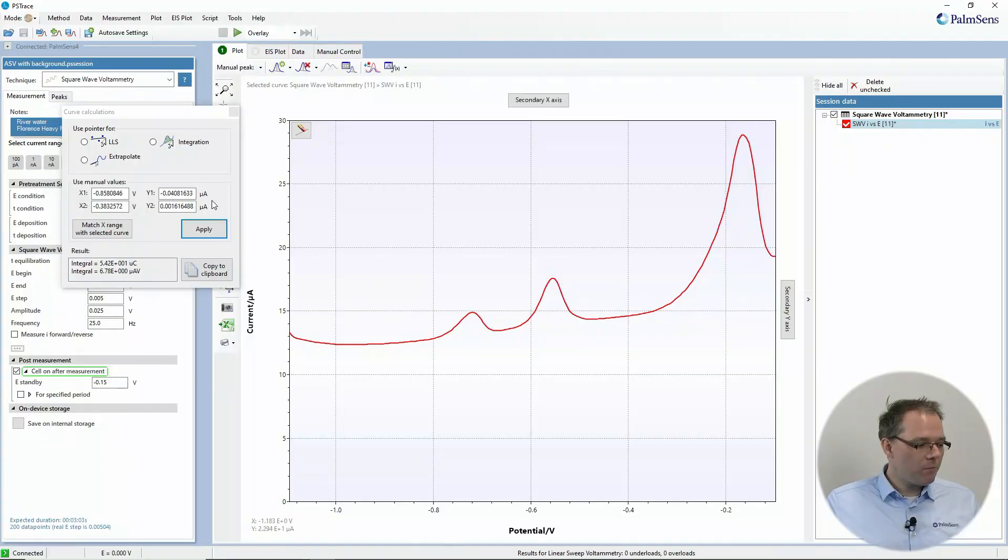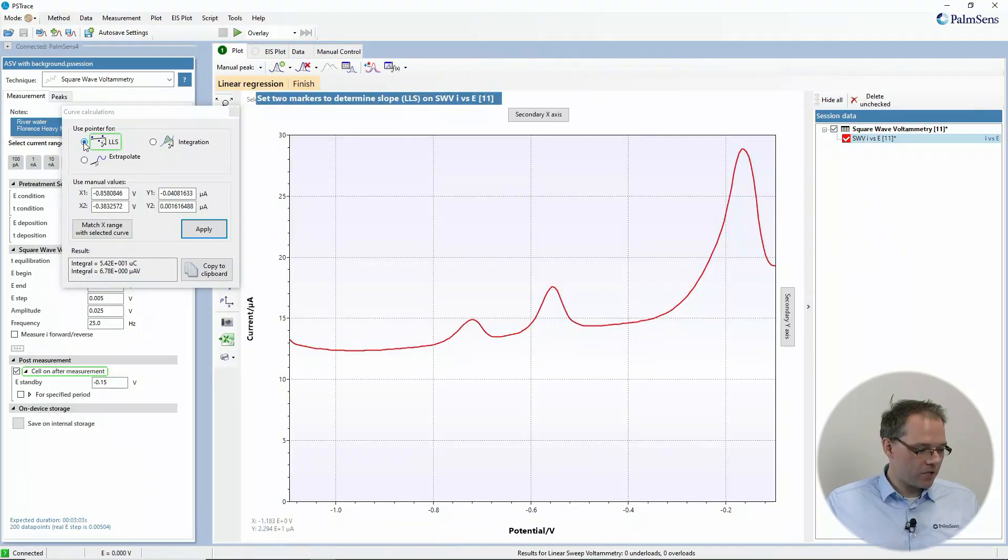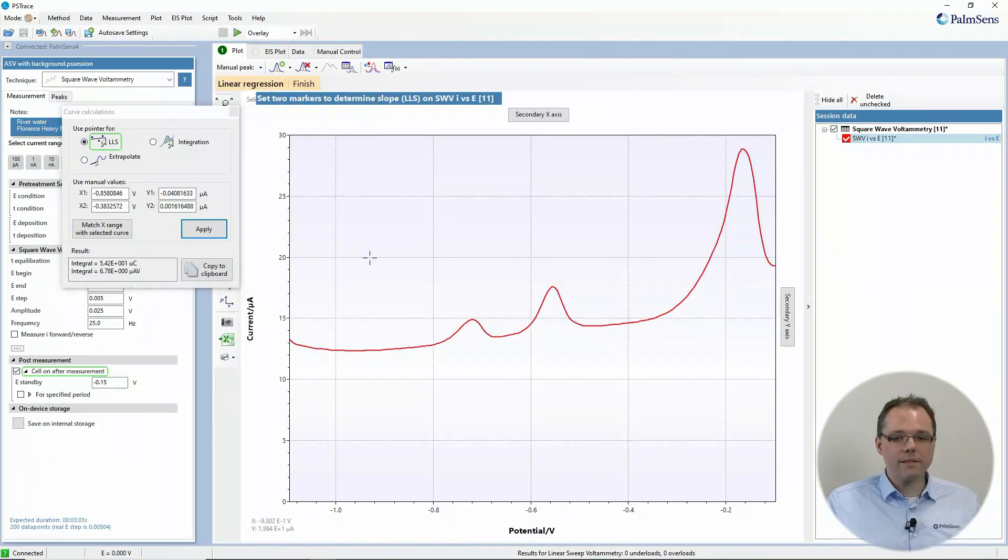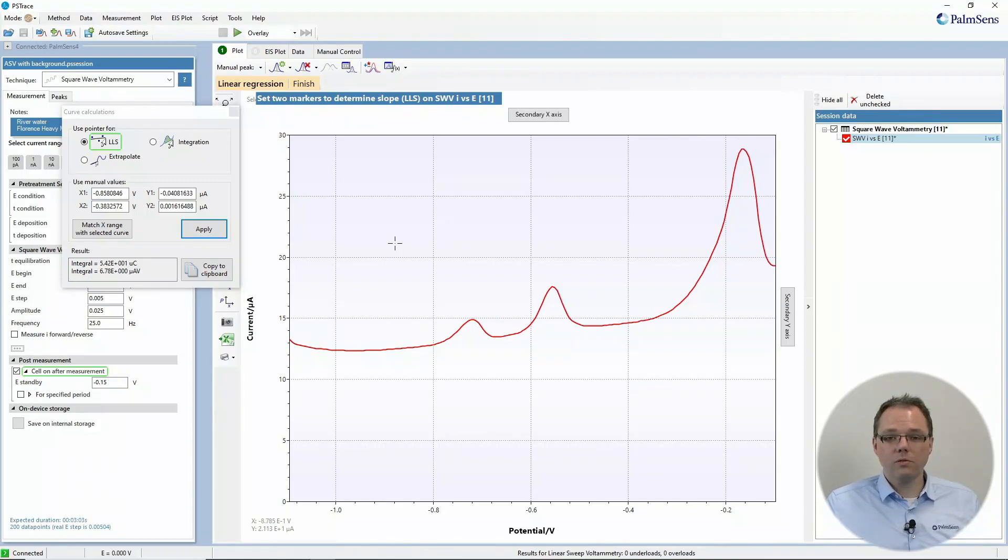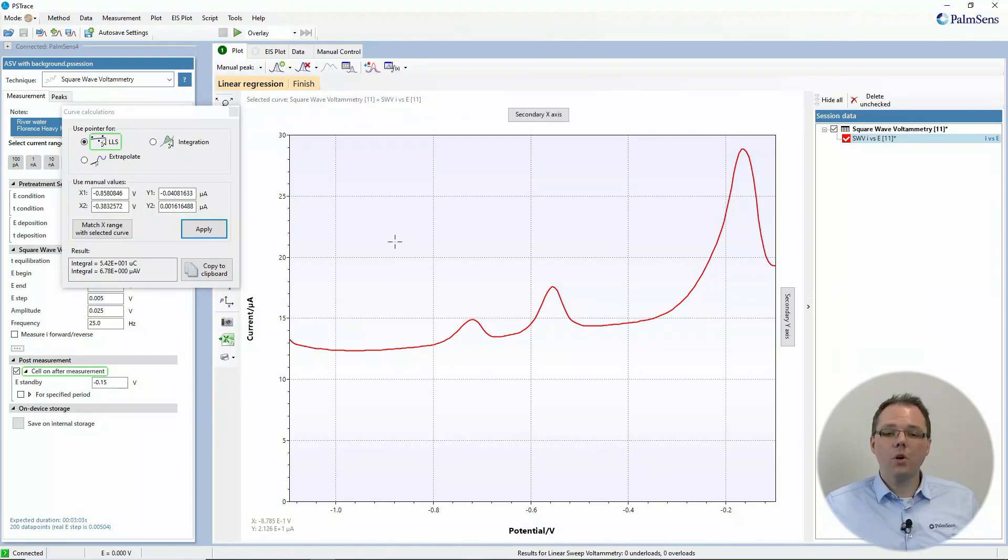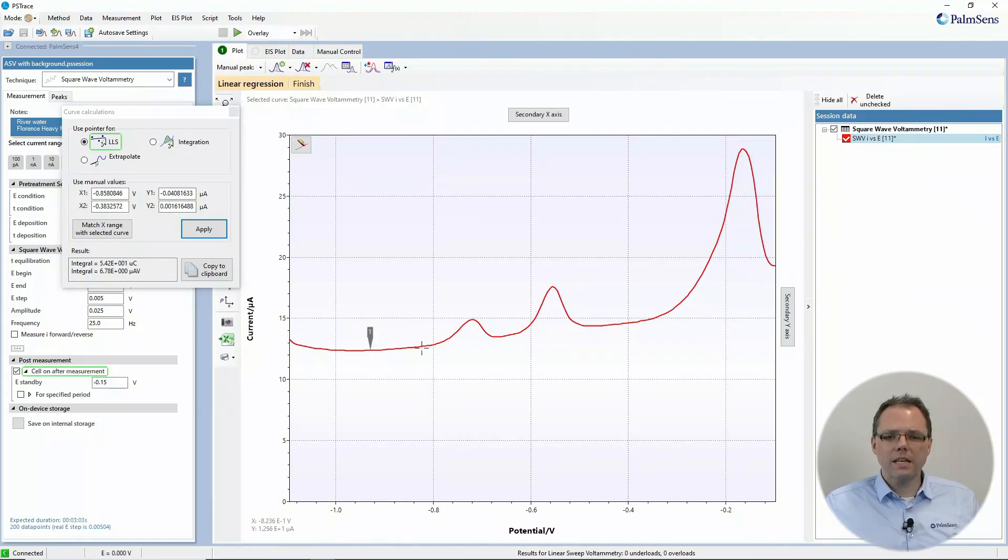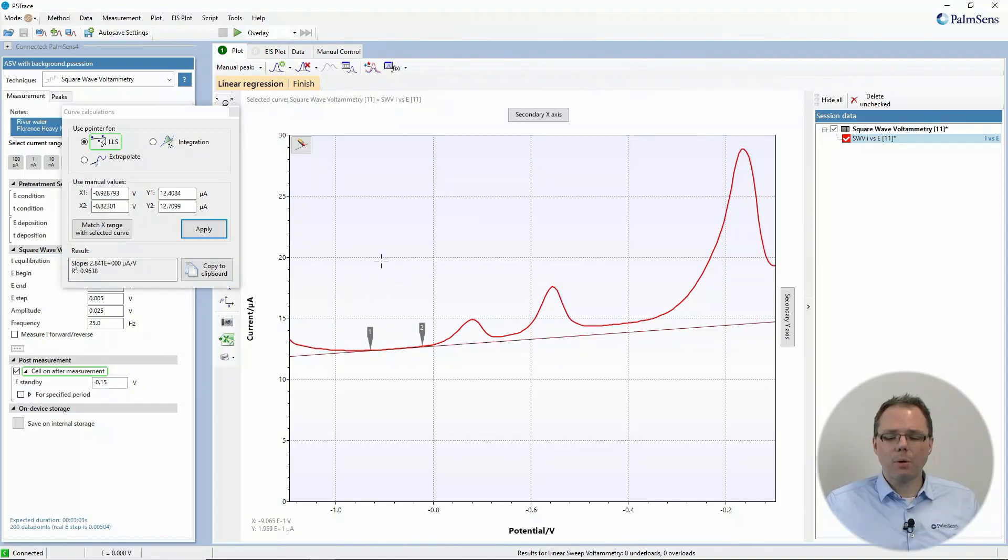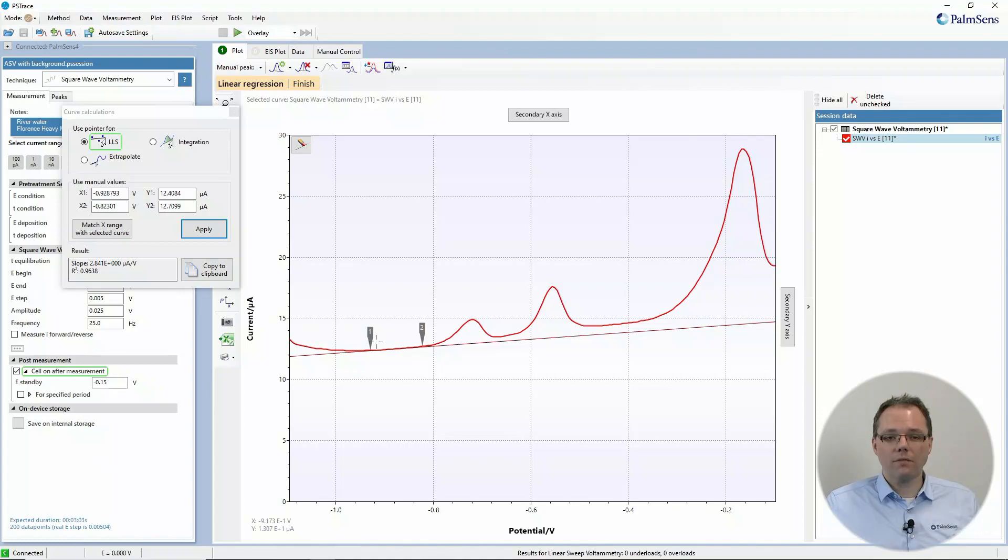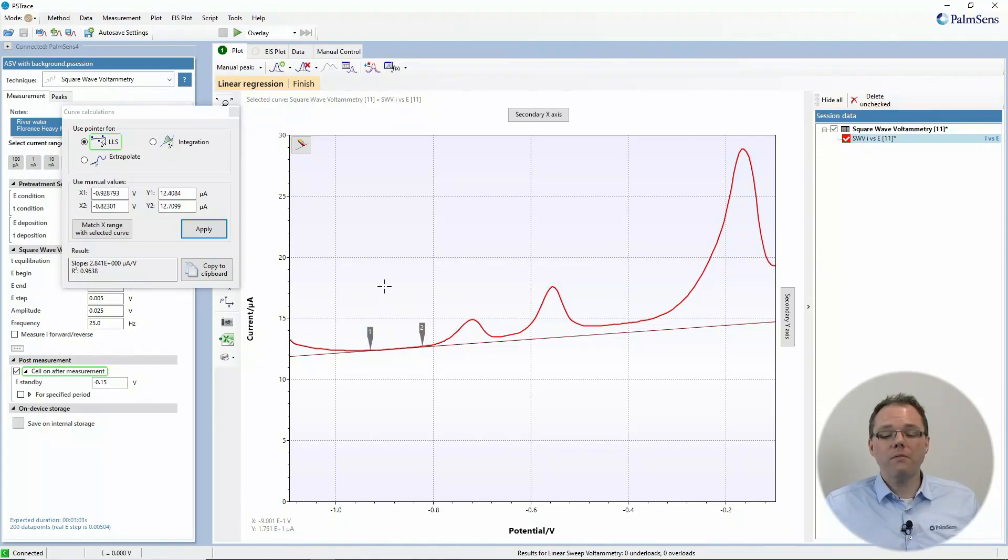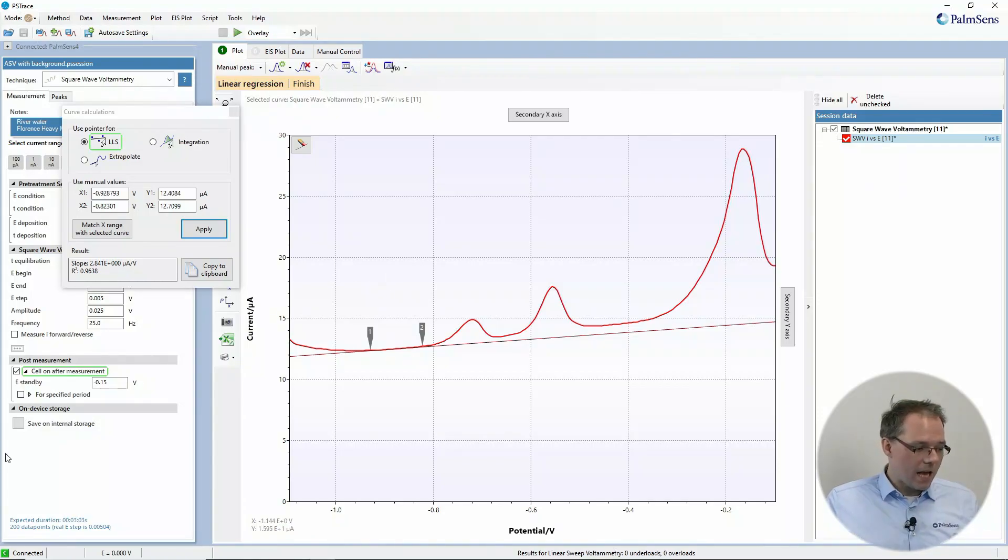So in the same window, you can find the option for linear regression. And what you can now do is you set two markers to define the part of the curve where you want to do the linear regression. So maybe you want to find out how close is actually this to really a proper line on the values that are in the curve. So now we take all these values between the two markers and perform a linear regression with it.